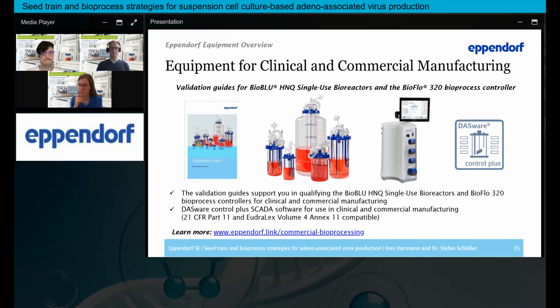All right, thank you, Stefan. There's also a bioreactor-related question. You used suspension cells here, but is it also possible to produce viral vectors from adherent cells in bioreactors? Stefan? Yes, this is definitely possible.